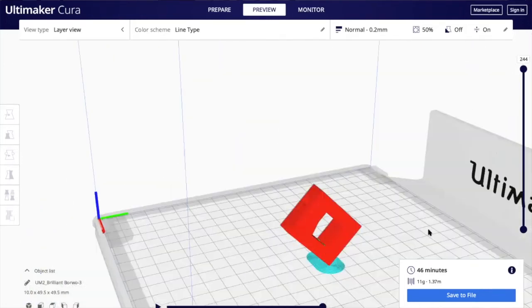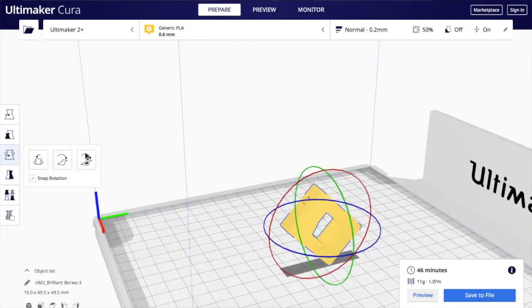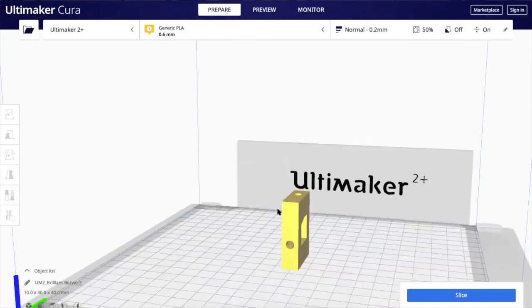Another thing that you need to consider when you are doing this job is how the printer works. Those printers work always layer by layer. So if I print in this direction and I try to bend it after it's printed, it's easier that you break it because you have layers in this direction.